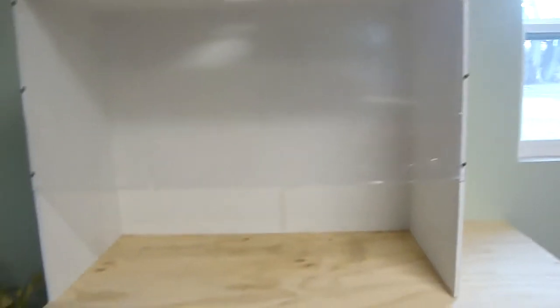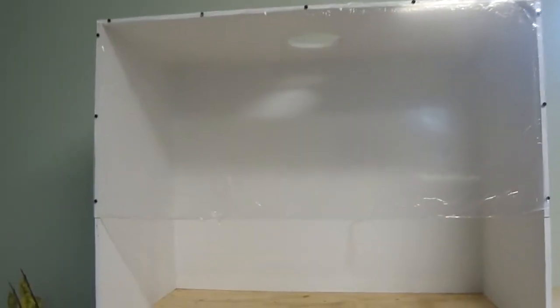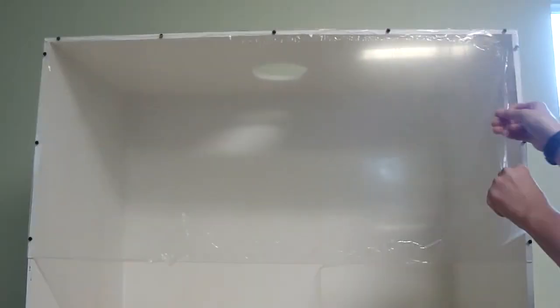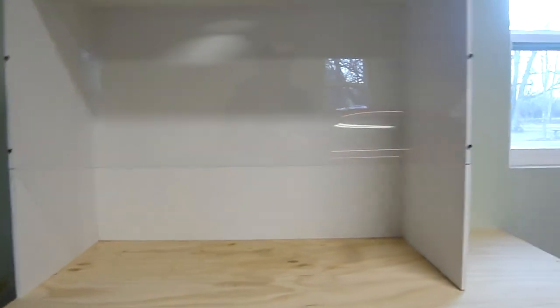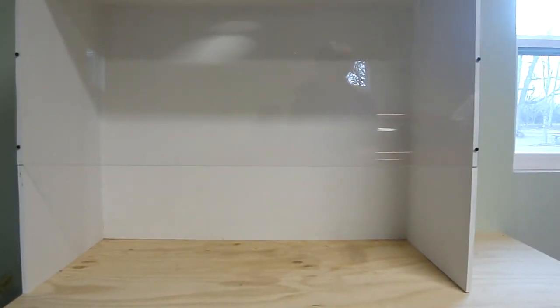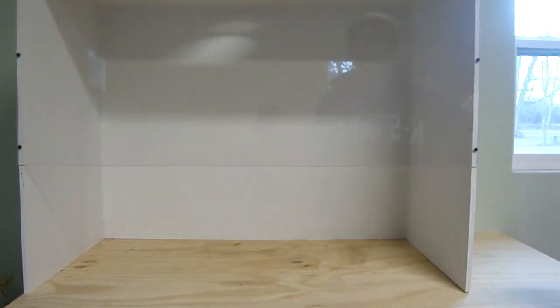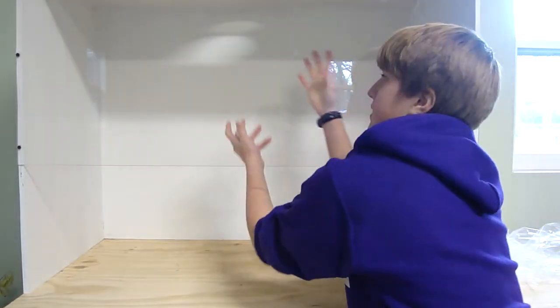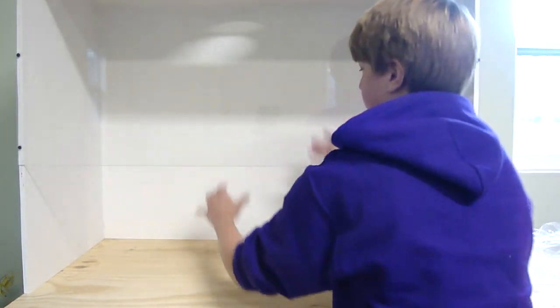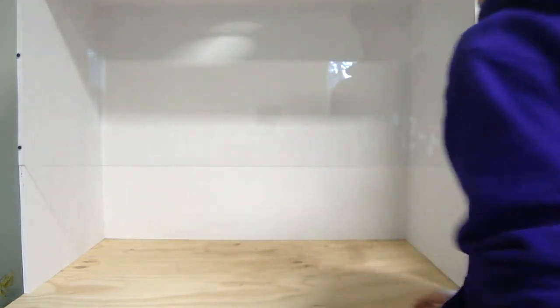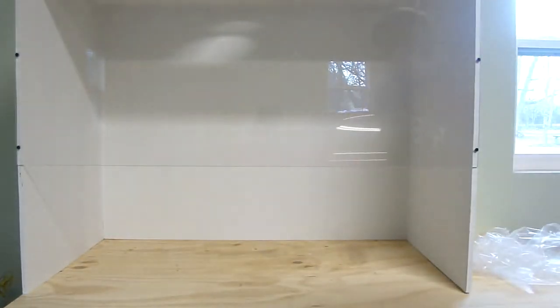So now I'm going to take off the protective plastic covering, and we'll see how the plexiglass looks. There you go. Looks pretty nice. And then this handhold's a good amount of space to work up in here.